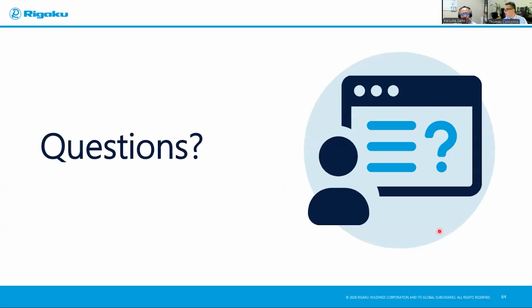All right. Thank you, Keisuke. We do have just about a couple of minutes left here, so I'm going to try and get a couple of questions in. I think we had a couple of nice ones come in, Keisuke. The first one is: in the context of film thickness measurement, can you also comment on Laue oscillations that are observable in regular XRD?